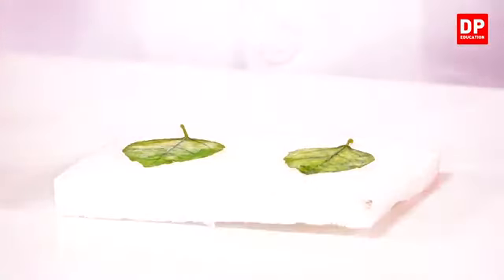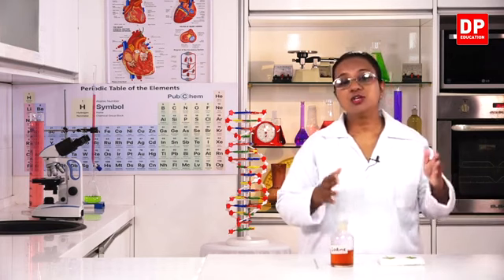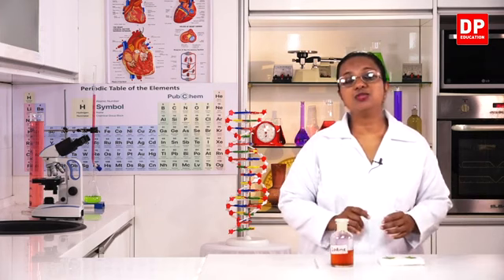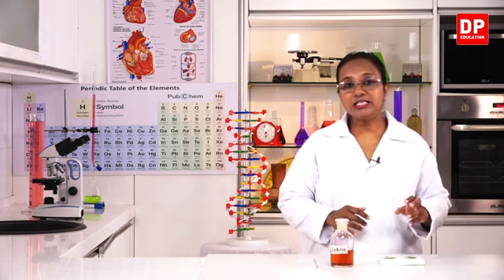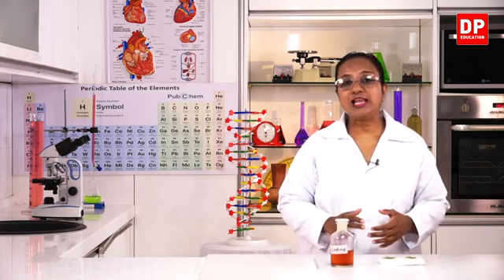After that, I have prepared the leaf for you so that it's ready to test for the presence of starch. You know the steps of this procedure. We have to boil the leaf in water first to make it more permeable. Then we boil it in alcohol using a water bath so that the chlorophyll will dissolve in alcohol. Since alcohol is highly flammable, we have to use the water bath. After that, when the alcohol solution becomes green in color, we stop boiling it, remove the leaf, and wash it well in water.